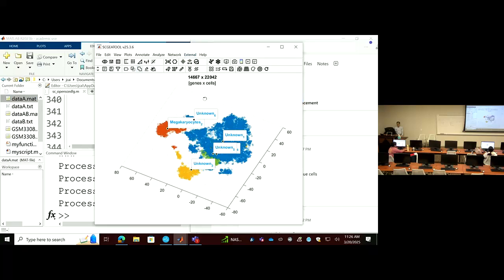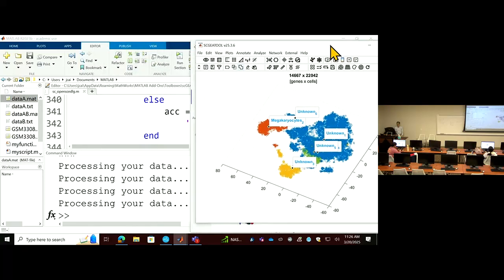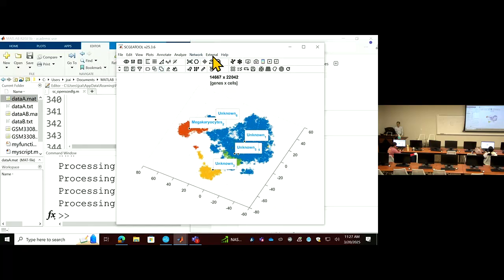So now if you click this, the program will ask you, there's nothing happened, it asks for a link to point to. So this Python environment hasn't been set up. In Windows, we need to find an executable file called python.exe.